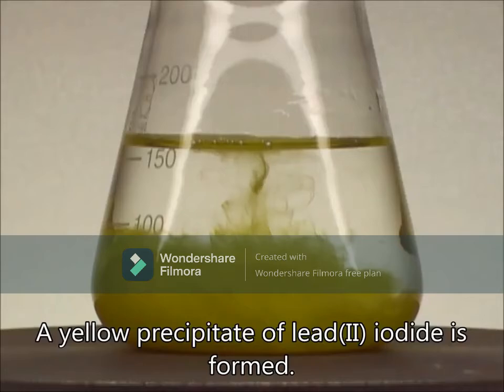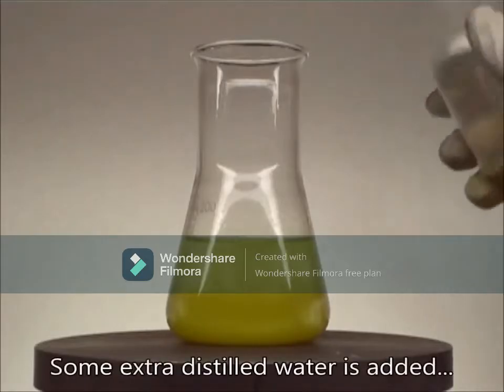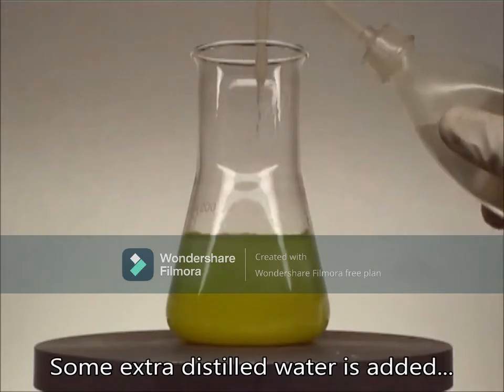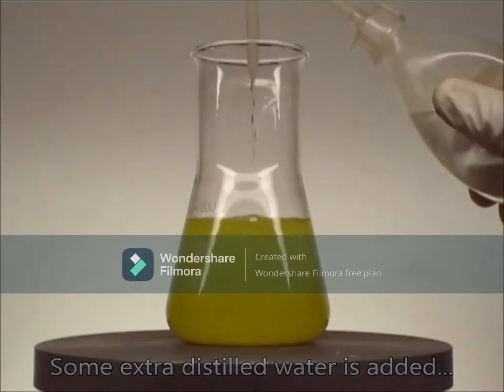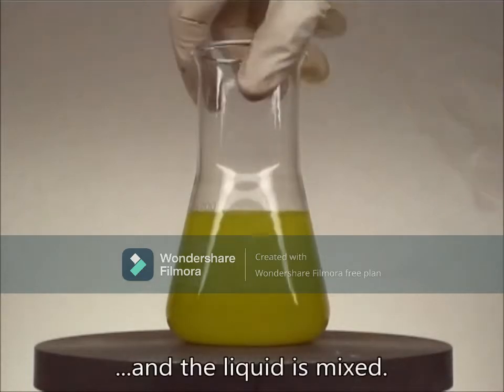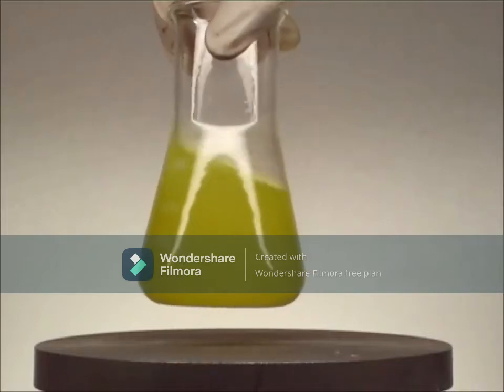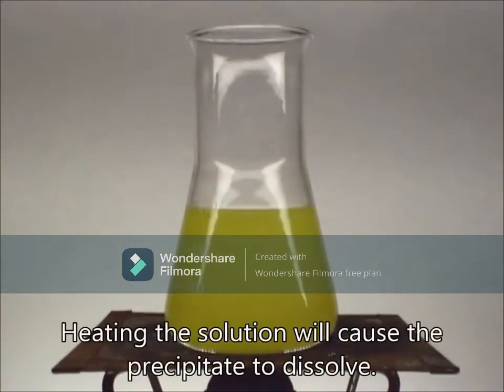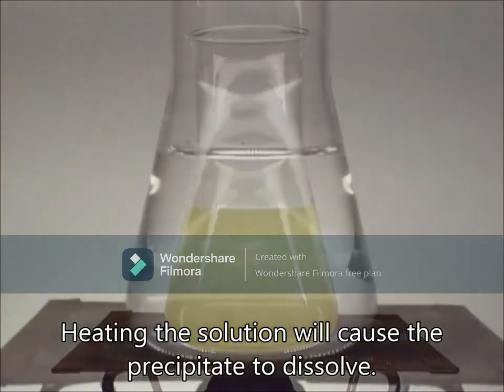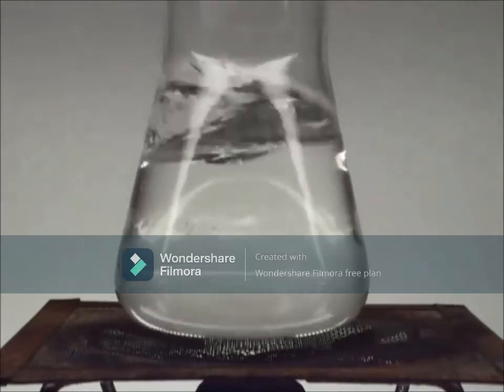A yellow precipitate of lead-2 iodide was forming, and some additional distilled water was added. And the liquid is mixed. Then the mixture was heated to cause the precipitate to dissolve.